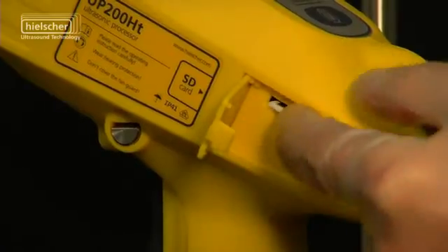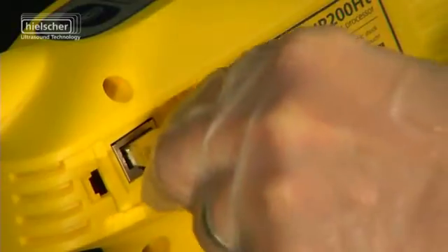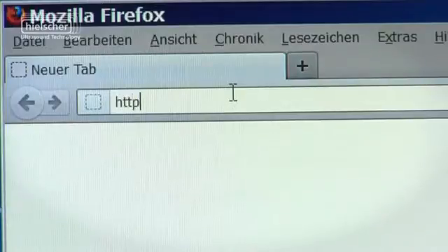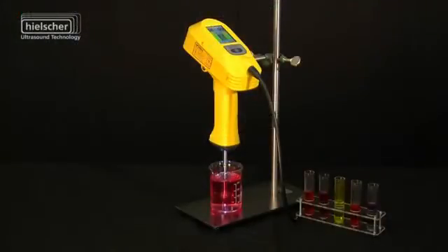Using the new LAN web interface, the UP200HT can be controlled via the browser remote control function from any standard web browser and allows for integration within existing network structures.